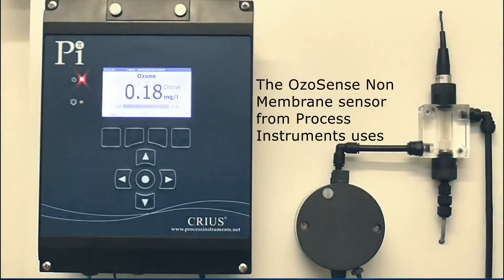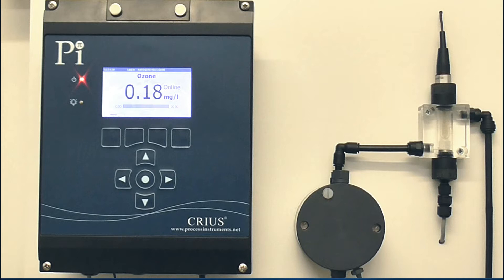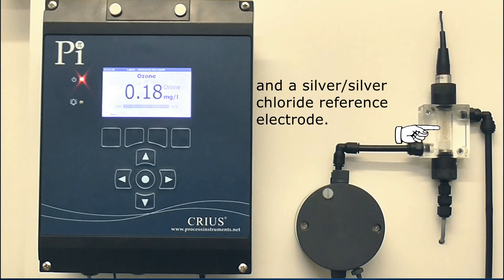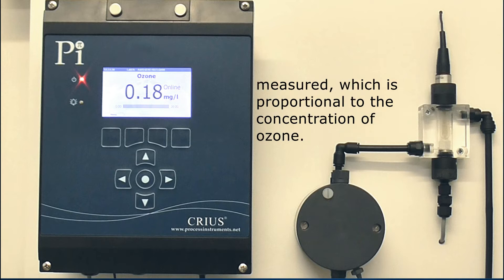The Ozosense non-membrane sensor from Process Instruments uses amperometry to electrochemically measure the concentration of ozone in water. The three electrode system includes a gold working electrode, a stainless steel counter electrode, and a silver silver chloride reference electrode. A constant potential is applied across the sensor and the resulting current is measured, which is proportional to the concentration of ozone.